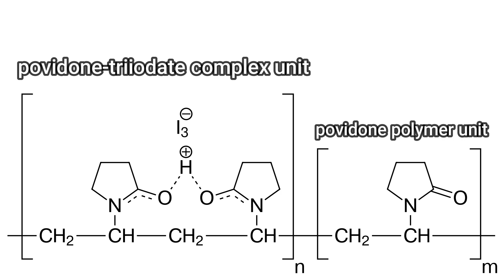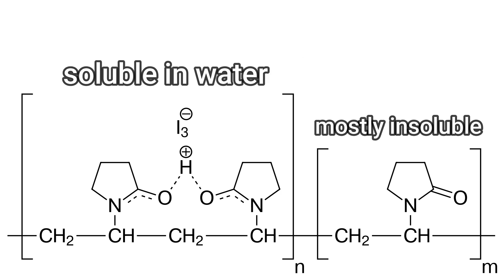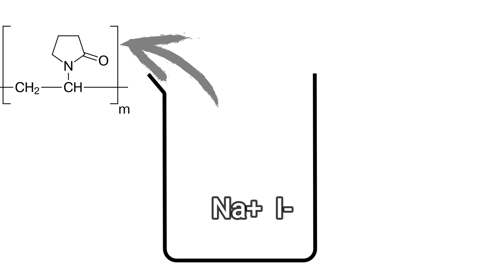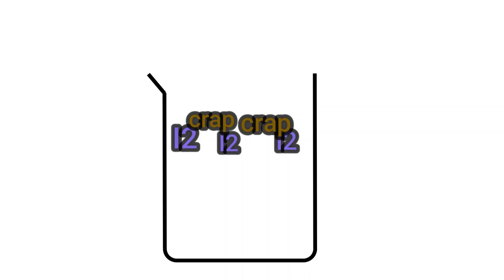We can't directly extract the iodine from the solution of betadine, because it's actually trapped in the soluble complex of povidone and triiodide ion. Otherwise the iodine would not be soluble enough in just plain water. The plan is to first separate the povidone polymer and make a sodium iodide solution, then precipitate elemental iodine by oxidation.